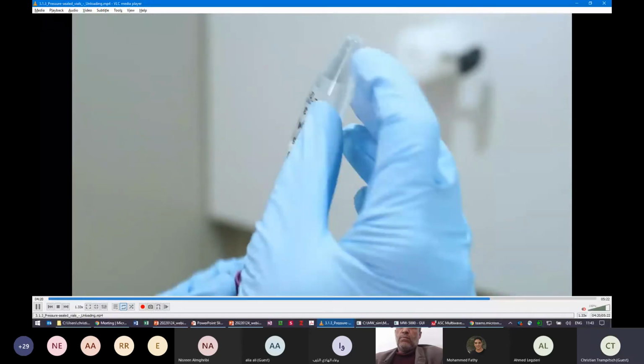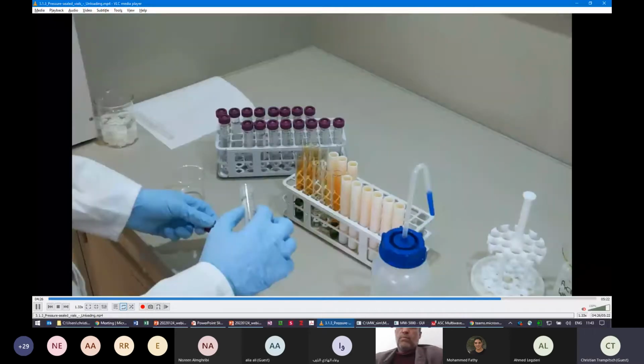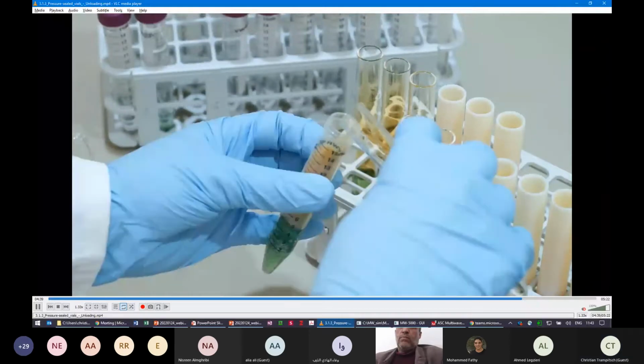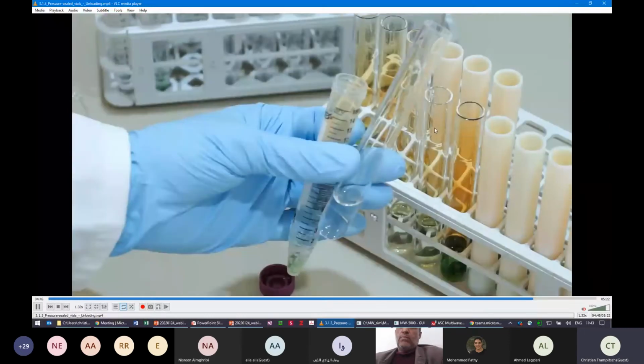And you see, again, a nice result. The dissolved nitrous gases are removed or are not visible after dilution anymore, and it works nicely. Okay, I think we can stop that here. We don't want to watch all the other 18 vials.